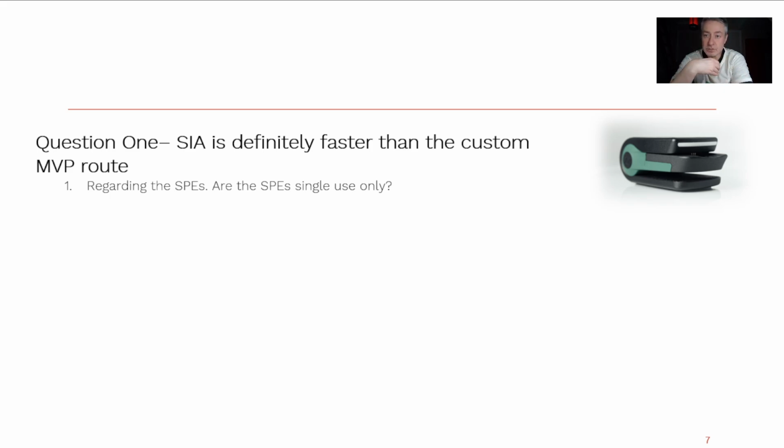Every time you see me do it tonight, I will dispose of the sensor, because I can't predict whether the sample is going to leave a residue on that sensor, or whether the assay is irreversibly changing the electrodes. So the safe answer to that question is that screen printed electrodes are single use. From a business perspective, it's also a better answer that screen printed electrodes are single use.